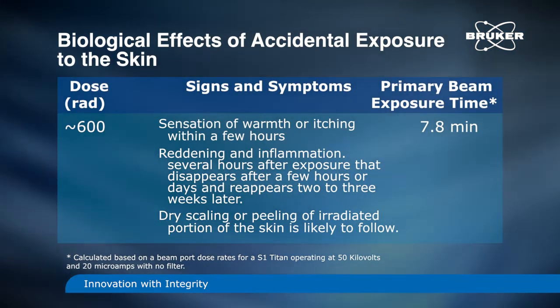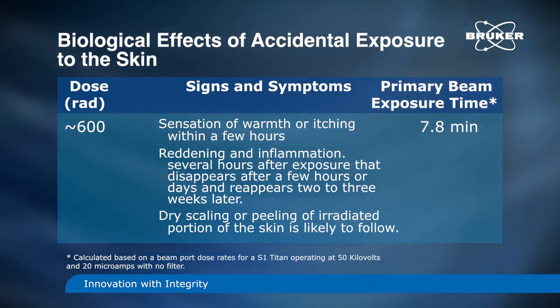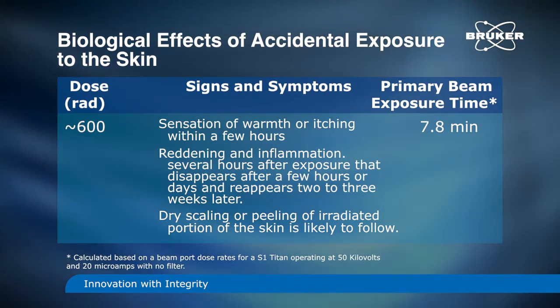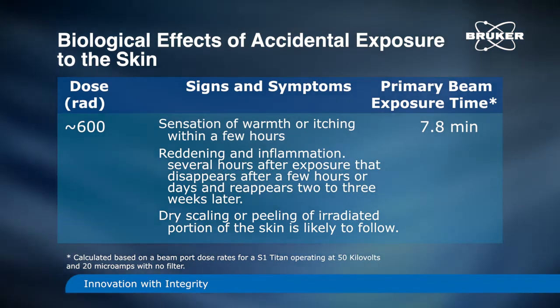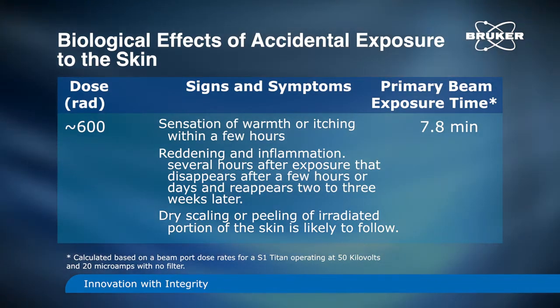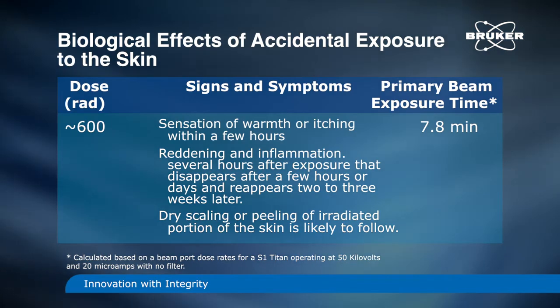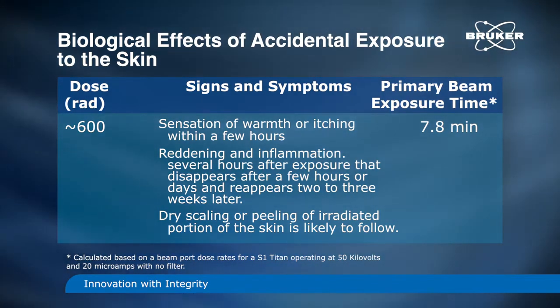Users of X-ray equipment should be aware of the signs and symptoms of accidental exposures to large amounts of radiation. Exposure of the extremities to an open, high-intensity gamma ray or X-ray beam can result in severe radiation burns in a matter of seconds. Radiation burns, or erythema, are the principal hazard associated with the use of analytical XRF equipment. These burns heal poorly, and on rare occasions have required amputation of fingers or surgery to remove affected flesh. The burn symptoms may require from 1 to several weeks to develop, depending on the dose.